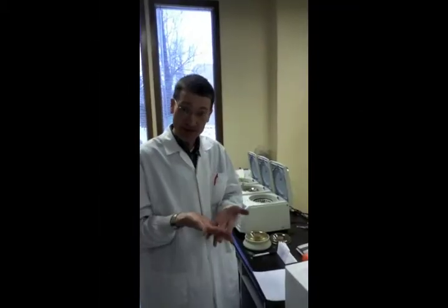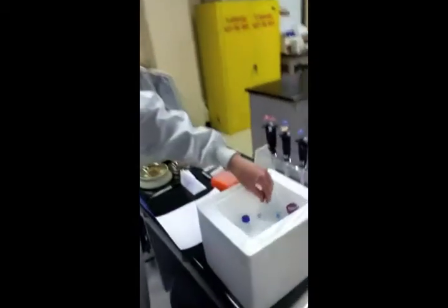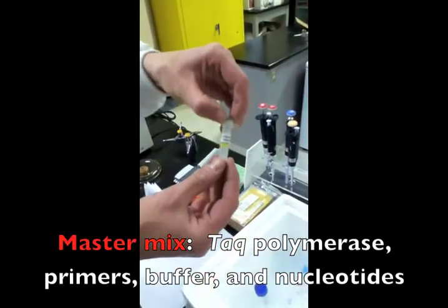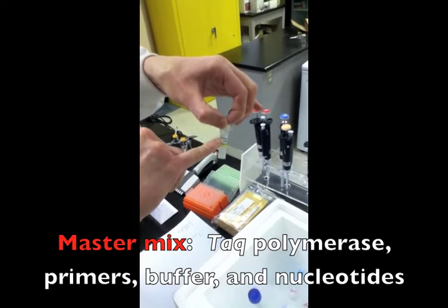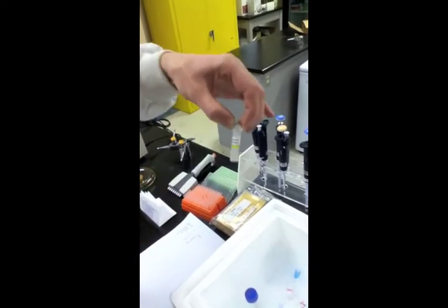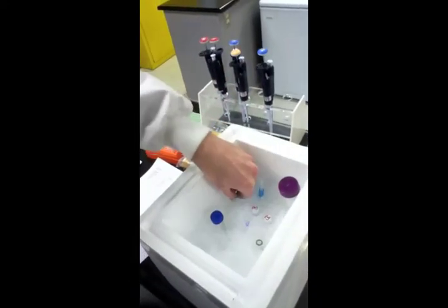Okay, as we talked about in class, as you remember, we need certain ingredients in order to polymerize DNA in a test tube. We'll need Taq polymerase. I doubt you can read that on the iPod camera, but it's a little tube of the actual enzyme, and it comes from a bacterium called Thermus aquaticus, which is a very heat-loving bacterium, which becomes very important for the PCR reaction. So we have Taq polymerase.